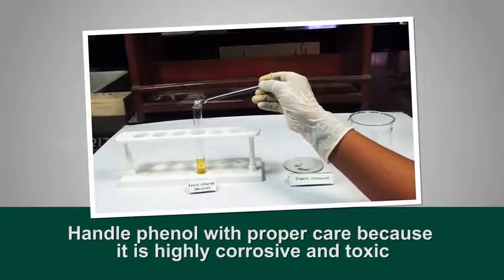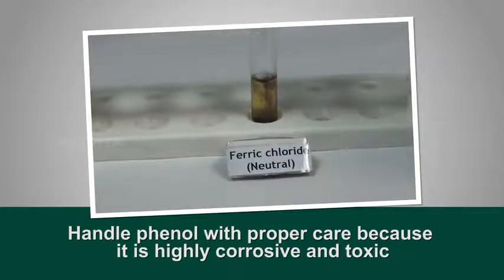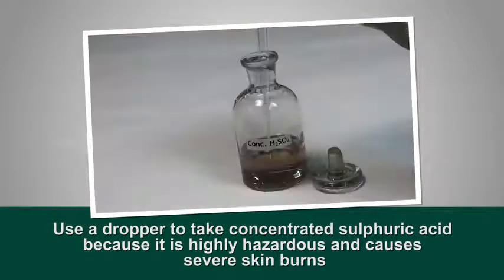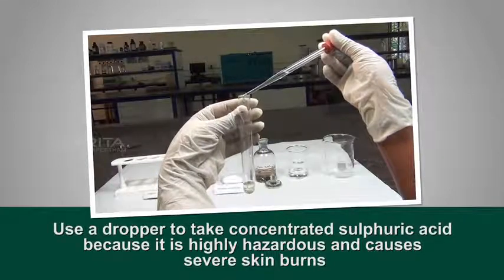Precautions: handle phenol with proper care because it is highly corrosive and toxic. Use a dropper to take concentrated sulfuric acid because it is highly hazardous and causes severe skin burns.